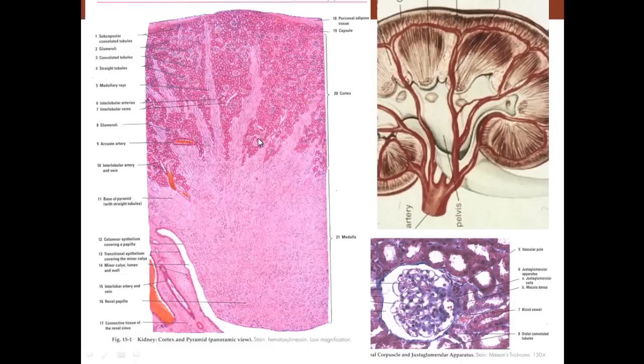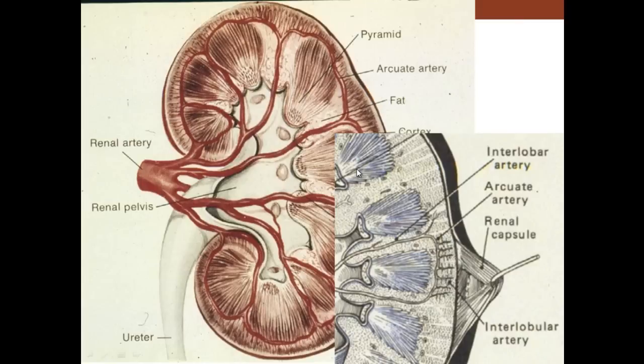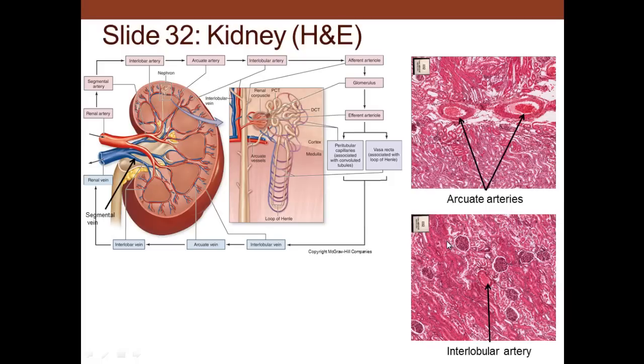Here we see the cortex and medulla. Let's see medullary rays run up in the cortical material, as you see in through there, the arcuate arteries going in through there, and where it interacts with the nephron, the blood interacts at the glomerulus. So again, we can see the arcuate artery coming in through there. With a higher mag, you can see that artery sends out other arteries that project up toward the surface, and from those is where the glomeruli are attached.